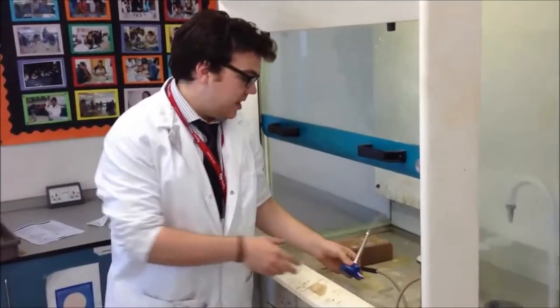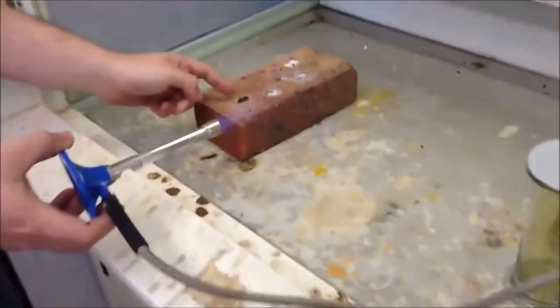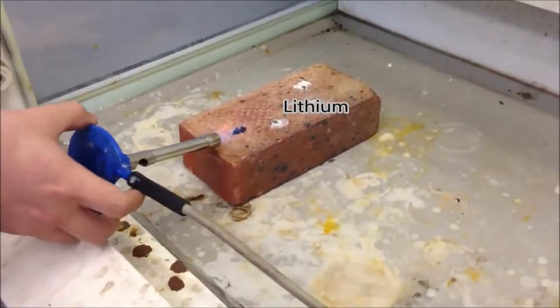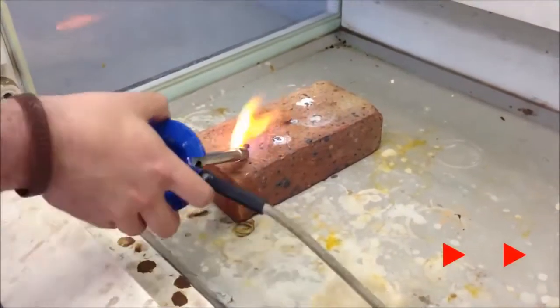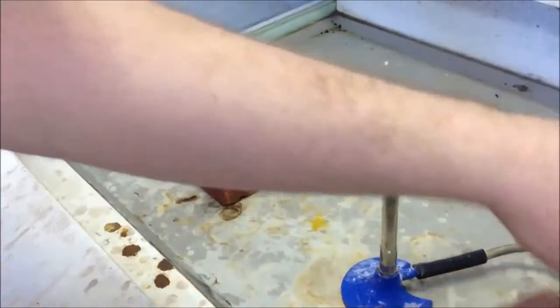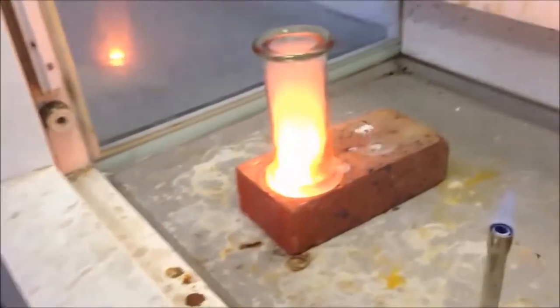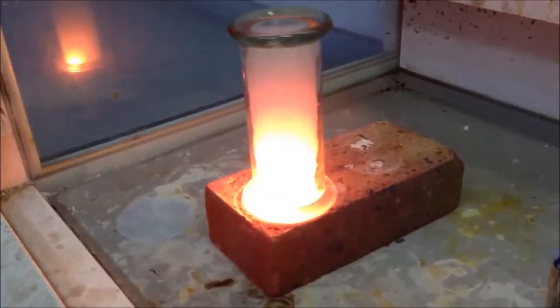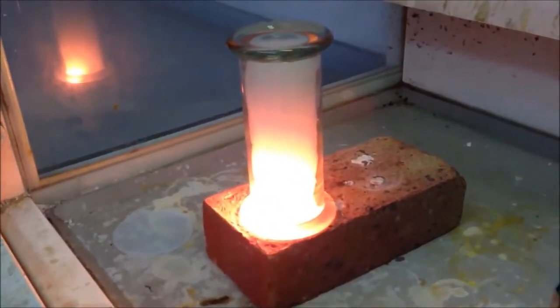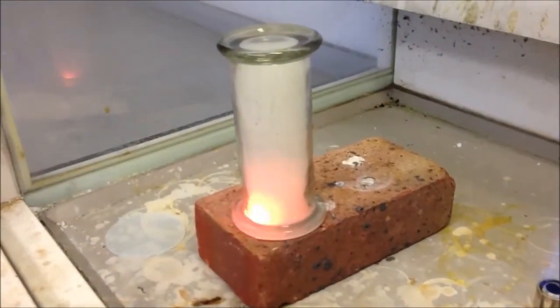The first thing I'm going to do is heat up my lithium so it's on fire. That's my lithium on the brick. Now it's started burning, we're going to do it with the chlorine.